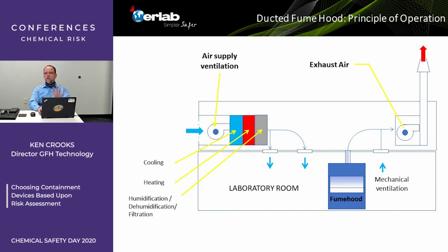So the fume hood is the primary containment zone. Part of the risk assessment, the laboratory almost always is negatively pressurized. You exhaust slightly more than you supply, so that it serves as a secondary containment zone. If you have a spill outside of the hood, if you have a spill on the open bench, you have odors, they'll be contained into that laboratory unit only and not spread throughout the building, hopefully.